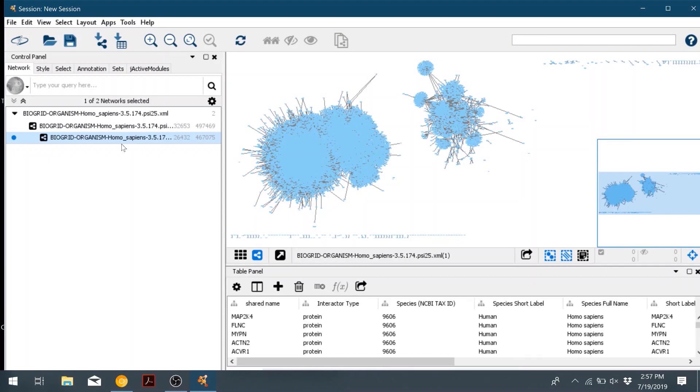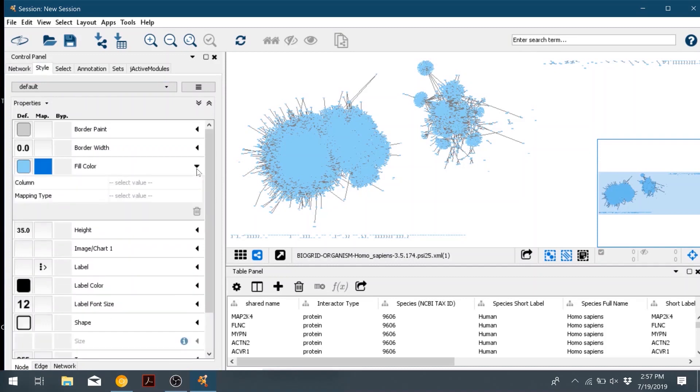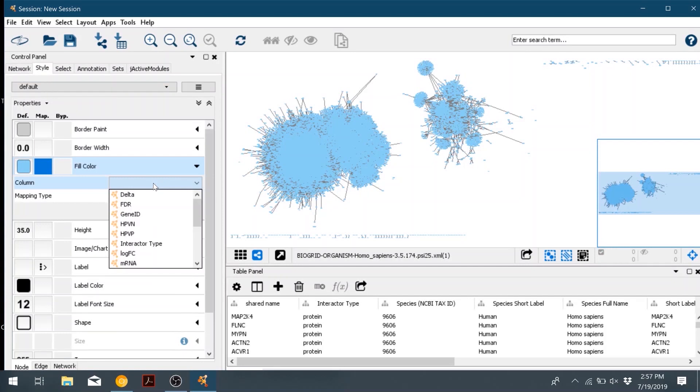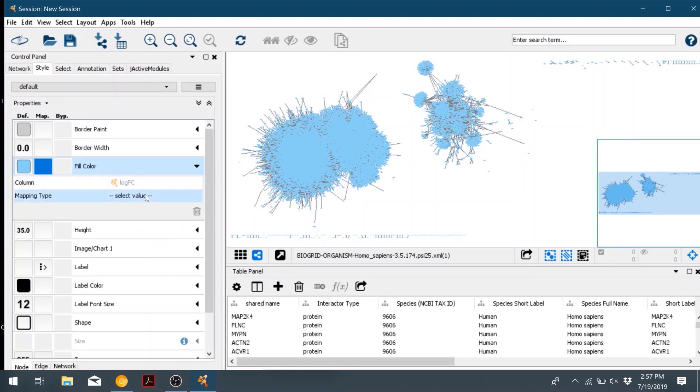So go to style, and then go down to fill color. Click on the middle button. We're going to color based on the logfc column. Then mapping type will be continuous mapping.